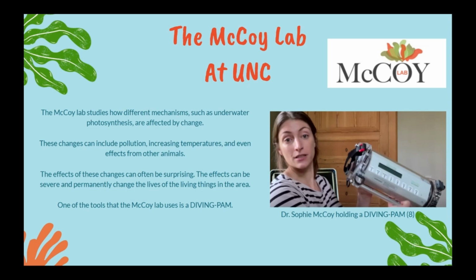One group that uses diving PAMs is the McCoy Lab at the University of North Carolina at Chapel Hill. The lab studies how different mechanisms, such as underwater photosynthesis, are affected by things like climate change. These changes can include pollution, increasing temperatures, and even effects from other animals.